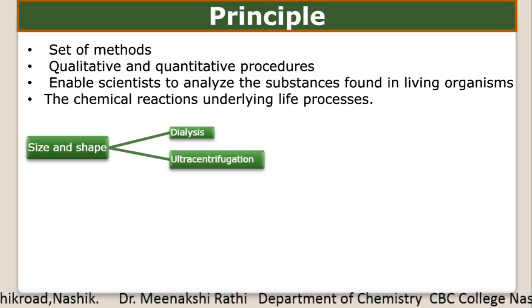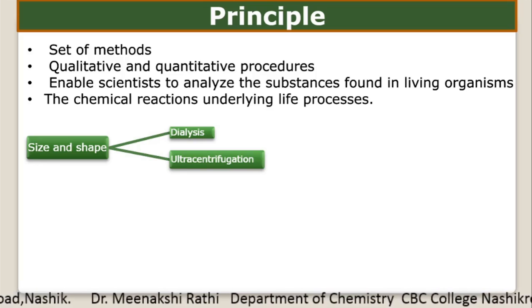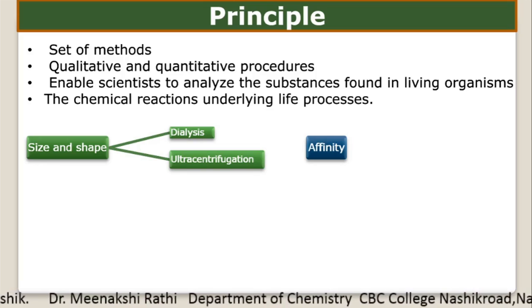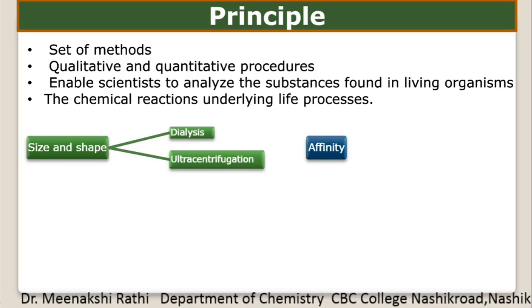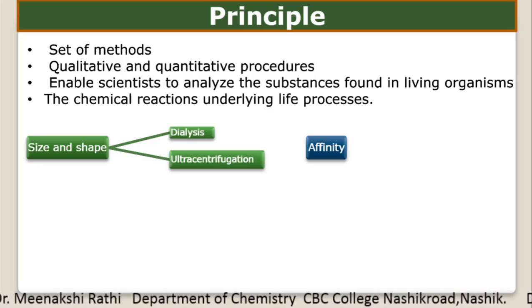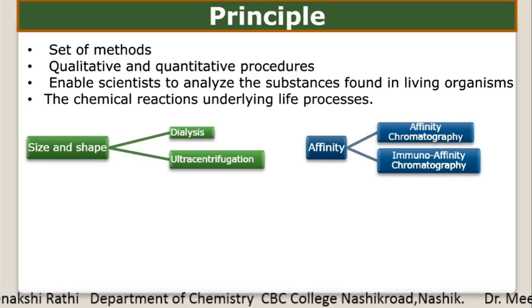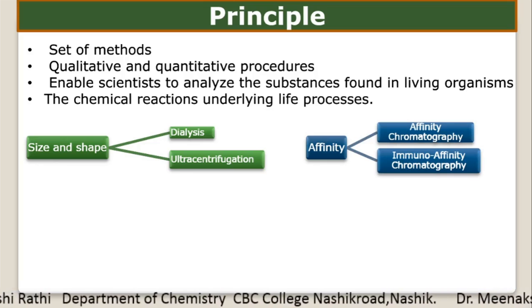One is dialysis and another is centrifugation or ultracentrifugation. Based on affinity, biomolecules have some special attraction. So based on that affinity, there are two techniques. One is affinity chromatography and another is immunoaffinity chromatography.